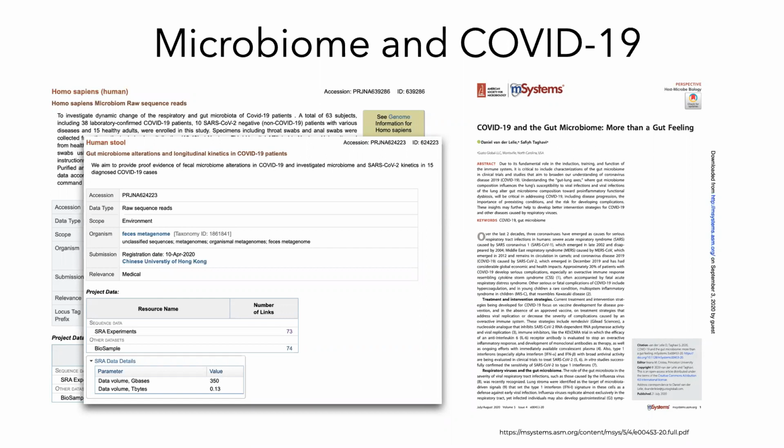So as you think about the data set that you have selected and you know what to look for, try to find not just any data set. For our next session, we want to only focus on 16S amplicon data. It has to have groups of at least 3 samples each, because you need to have some representation for your power of analysis.